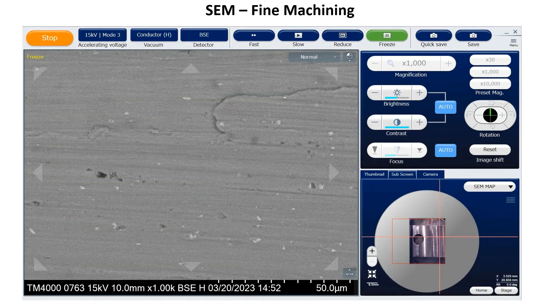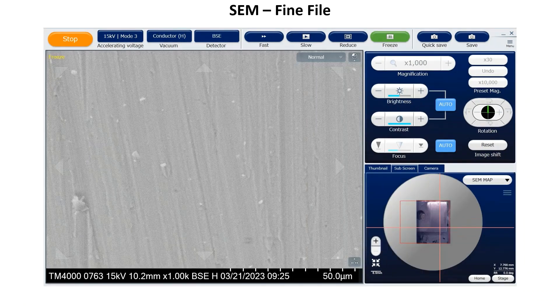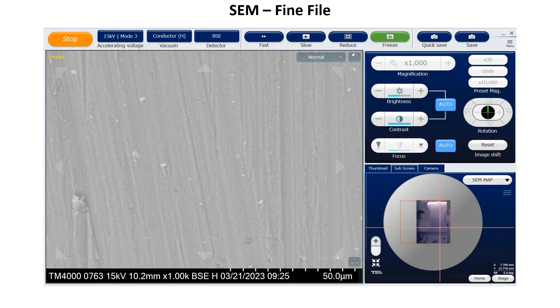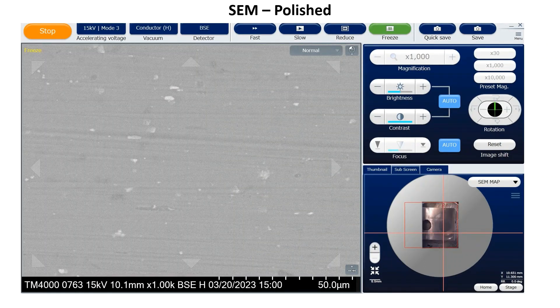This is nicer quality machining that was done at a lower travel speed with a sharp quarter inch diameter two flute end mill. You can see that the horizontal lines are much finer and closer together than the roughly machined part. I ran a fine single cut file over the bead blasted surface until the surface was uniform. The lines are in the direction of my file strokes. The finish looked like the finely machined surface finish macroscopically, and at a thousand times magnification the lines and spacing are similar as well.